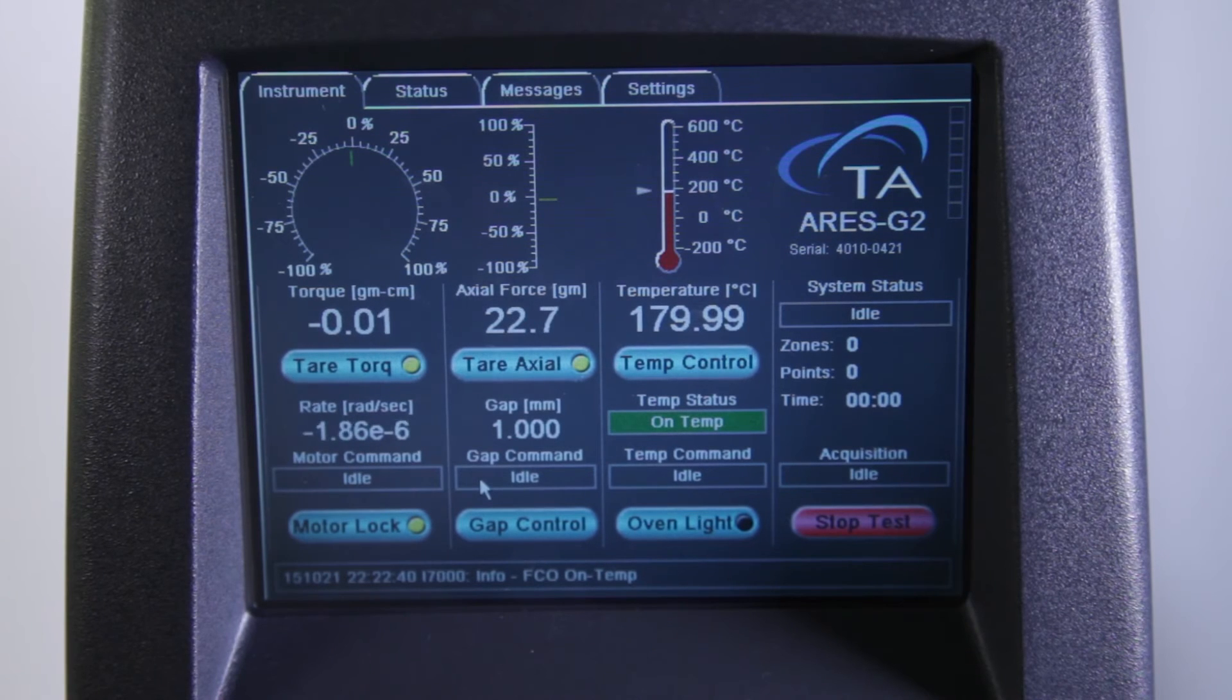For this low density polyethylene sample, the axial force will easily relax below 10 grams within a couple of minutes. For higher molecular weight or entangled polymers, the axial force may take a long time to relax. In these cases, for best reproducibility, the two options are to either wait an extended time for full relaxation, or just wait until the axial force relaxes to the same arbitrary selected value.